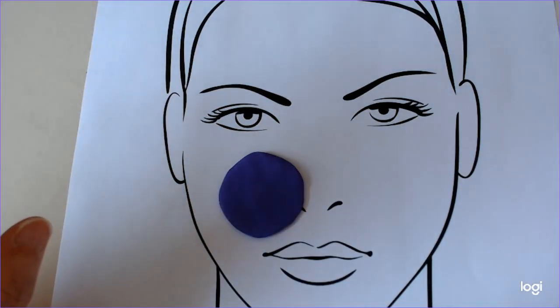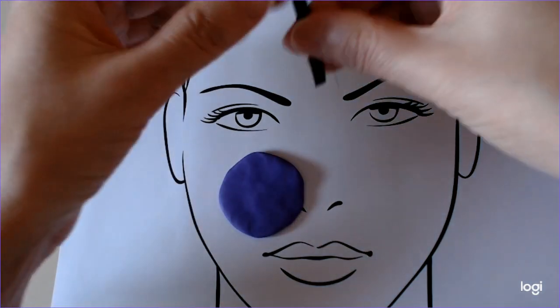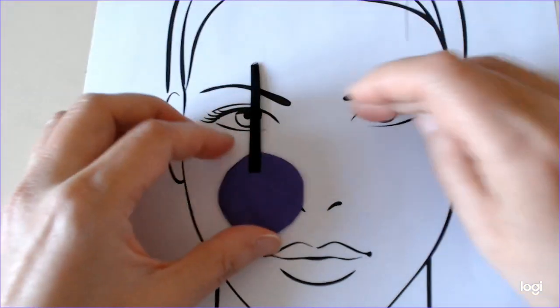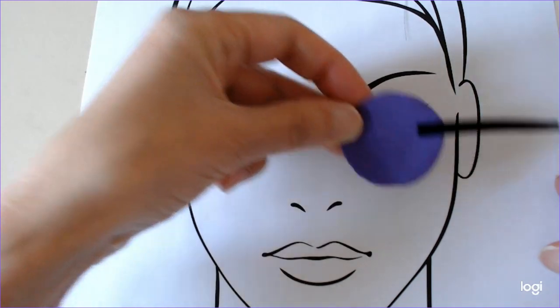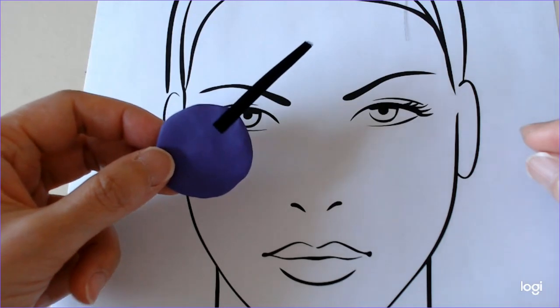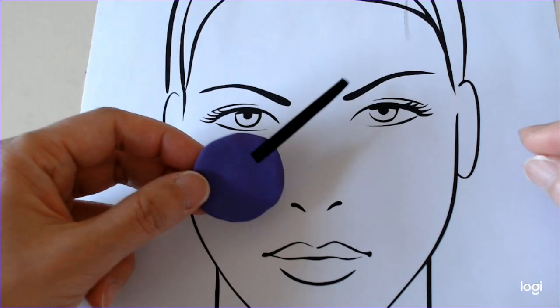I'll talk about sutures here, although there are other methods. For skin, we usually know which surface is the front and which the back. The surgeon can insert a single suture to indicate orientation. They might describe it as 12 o'clock, superior, or lateral. If they don't use clock hours, it's important to say whether the specimen is from the left or right. The pathologist can deduce from that single suture where the other margins are.